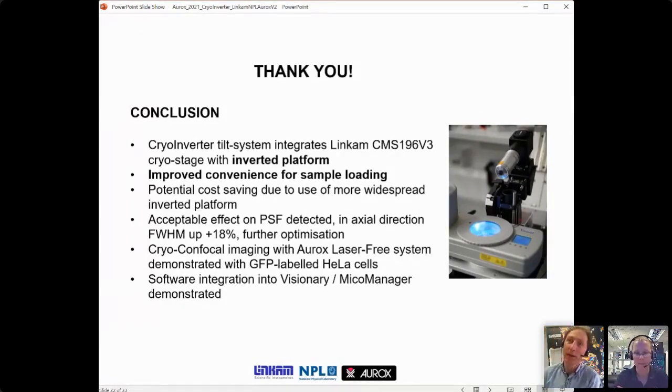Yes. Also, the lens is mounted onto more metal parts, and the heat transfer to the tip of the lens is not that high, and because it's quite a large metal mass, it takes a long time to cool down. It's relatively steady because of the mass.